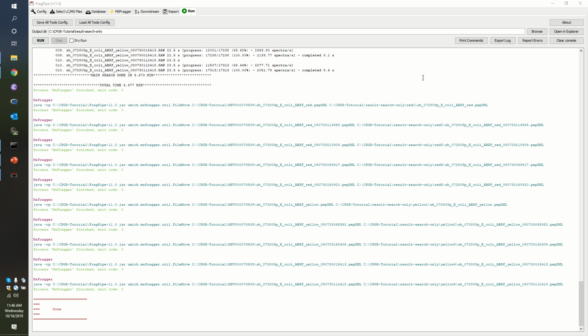So actually what just happened is that, first off, we just searched 10 raw files in the space of 5 minutes on a laptop. That would not have been possible a couple years ago. One of the things that is most shocking about that 5 minutes is that much of that time was spent reading files. Remember that each of these files is about 1/3 of a gigabyte in size. And even if you're working off of an SSD, like this machine is, you still have some amount of time required to read all of those bytes. Then they had to be interpreted by the library, and then and only then could it compare all the peptide sequences to spectra.